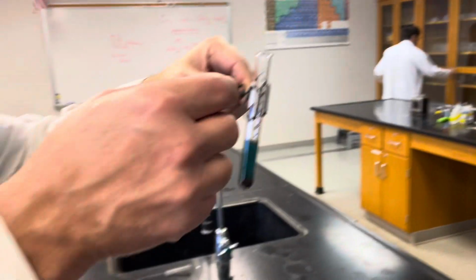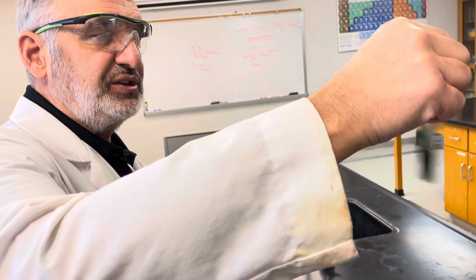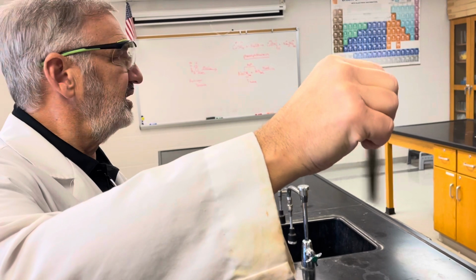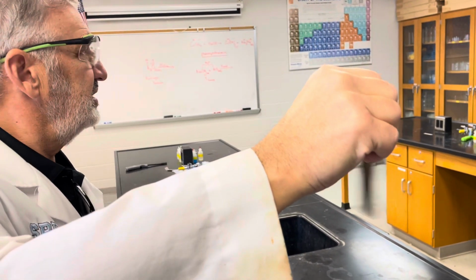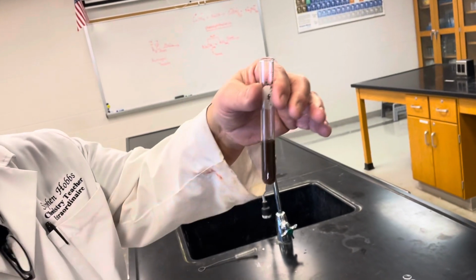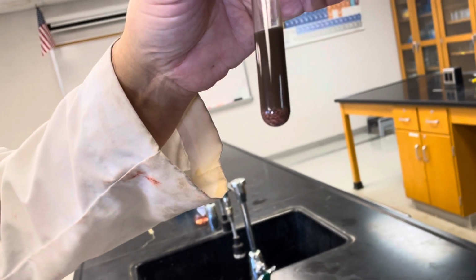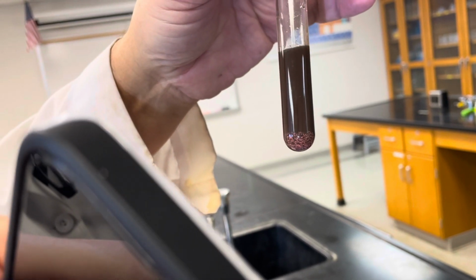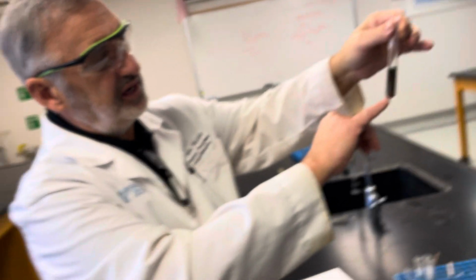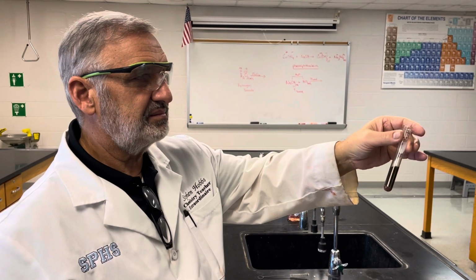Now I'm going to take this. I can tell that it's not going to bubble over or anything, and I'm just going to try to mix it up really well. And you can really see the reddish brown solid forming at the bottom, and the blue color is actually slowly fading away. So you're getting a reddish brown solid there, and the blue color is fading away in this reaction.